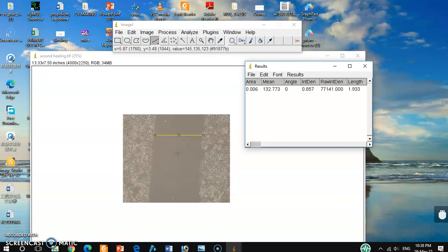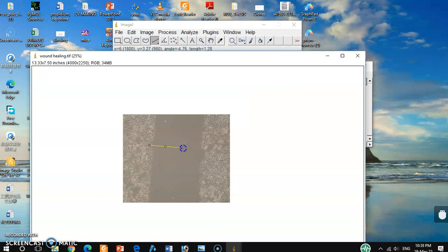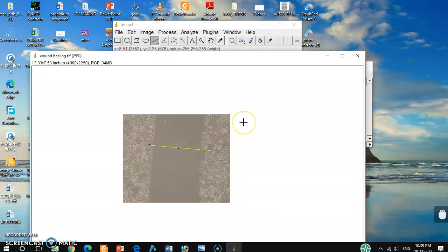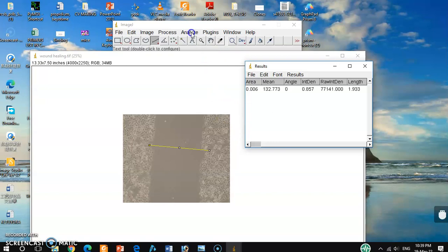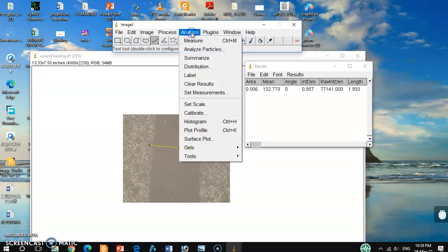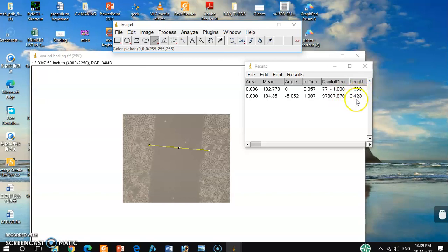In this picture, I want to measure another longer distance. For example, this one. Although this is not a straight line, I just want to show you that this is a little bigger, so the measurement should be a little longer than the previous one. Again, click analyze and hit measure. You can see the length is 2.42, so it is longer than the previous one.